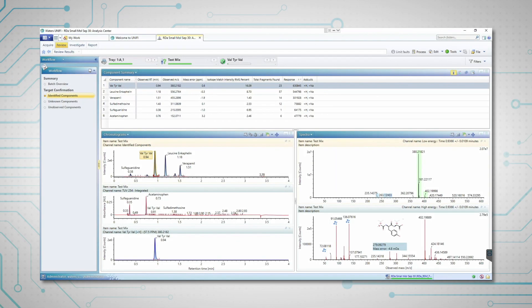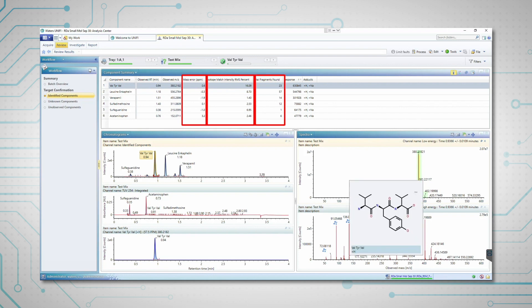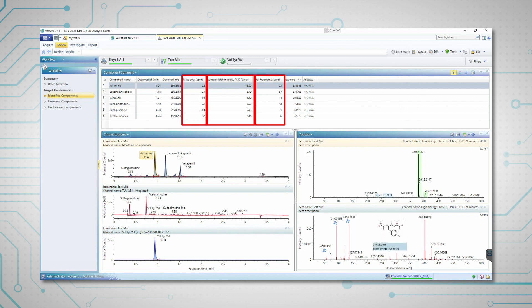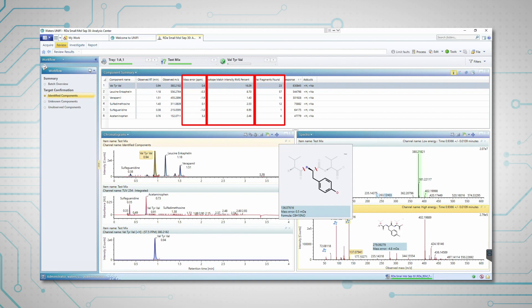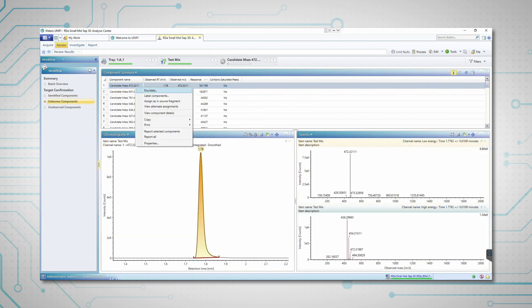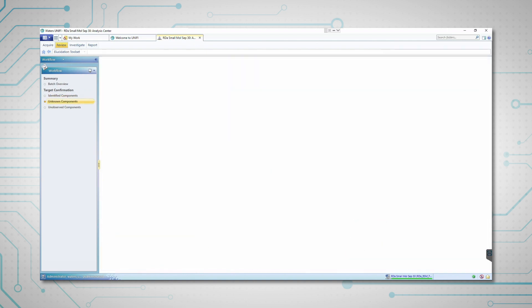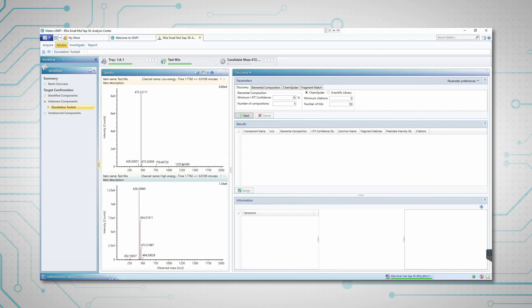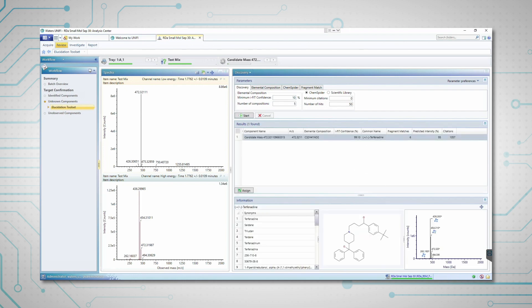The customizable workflow for data review gives a step-by-step approach to evaluate results. The combination of accurate mass measurement, isotope modelling and the identification of high-energy fragments is used to increase confidence in compound identification. The discovery toolset can be used to help elucidate any unidentified species, combining elemental composition prediction with database searching and in-silico fragment matching to enable identification of unknown compounds.